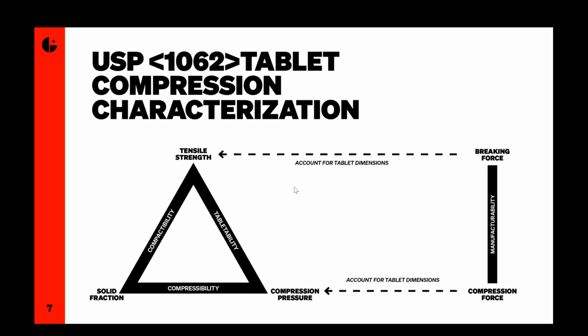By doing this, it means that the tablets that we use to carry out the compaction analysis don't have to be the same size and shape as the one that we're using in production. You're probably familiar with hardness testing of tablets as a QC test, and the hardness value doesn't take account of size and shape, but in QC they're always comparing the same size and shape of tablet when they're generating that data, so it's not necessary.